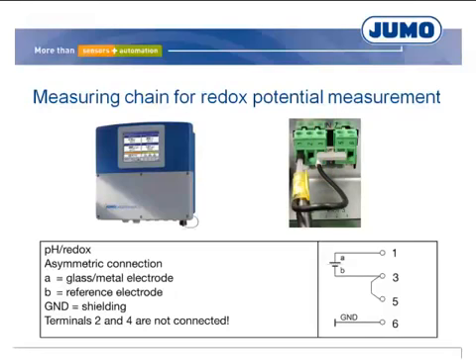Terminal 3 must be connected to terminal 5 via a short circuit jumper that is included in the scope of delivery.